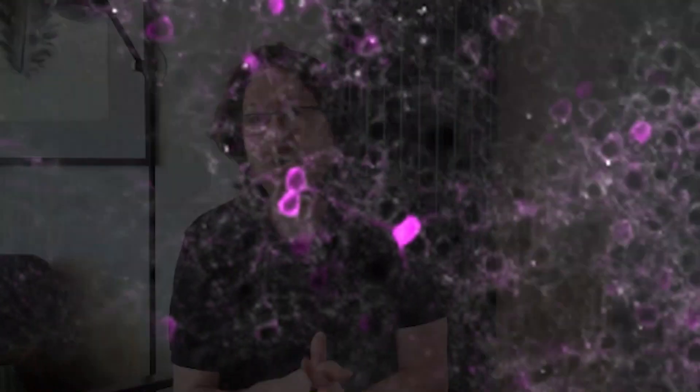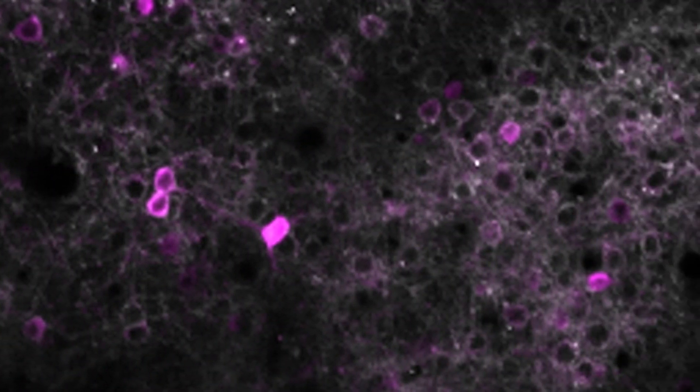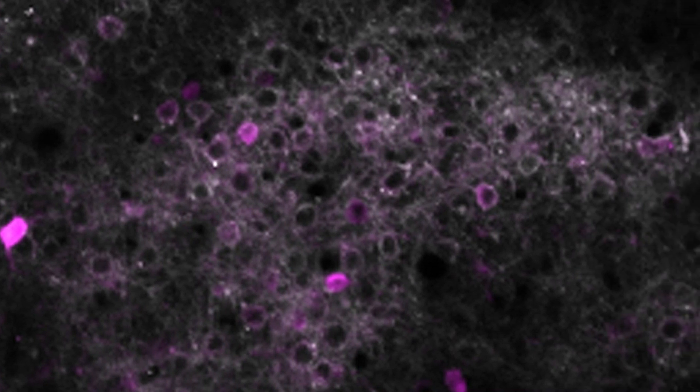We're able to achieve a large field of view for simultaneous photo stimulation. In terms of laser throughput, we have high efficiency, so there's more power out of the objective for a given laser. And we ensure that for the most commonly used multi-photon objectives, we're properly filling the back aperture, which means we can achieve a high effective numerical aperture and thus good resolution in axial as well as lateral dimensions.